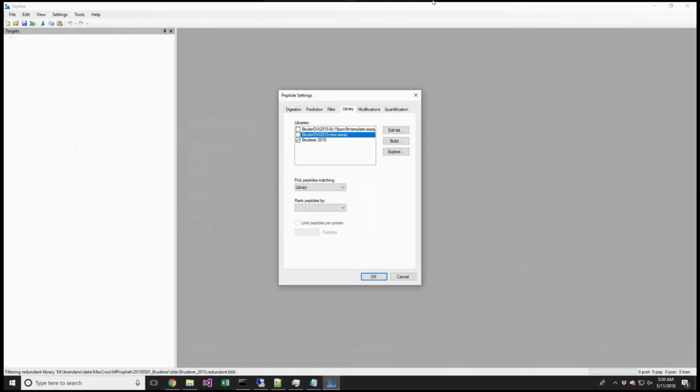Any other questions? Yeah. Processing your data to generate a high quality spectral library. Can he use a Python script upstream of this? Yeah. And then he also said, well, it's probably just easier to use Skyline.